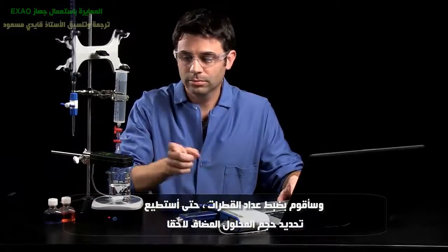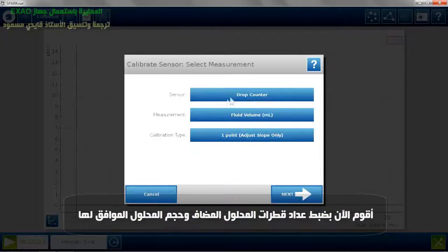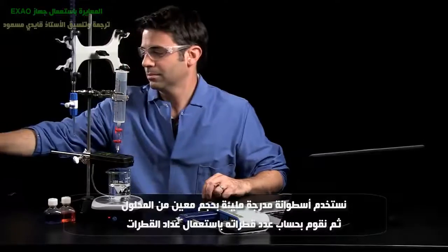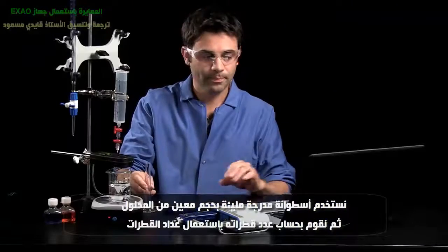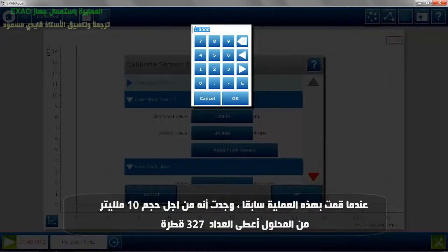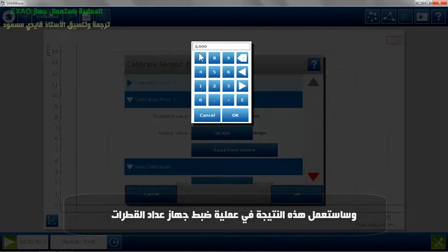I need to calibrate my drop counter so that it knows what the fluid volume is. The way to do this is you use a graduated cylinder and drop the titrant through the drop counter into the graduated cylinder until a certain volume. I know that in 10 milliliters of volume, the drop counter counted 327 drops, so I'm going to use that as my calibration.